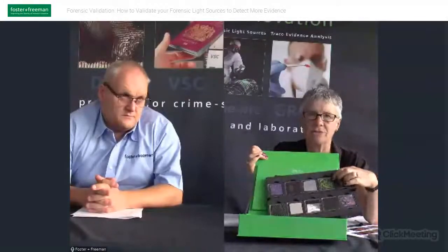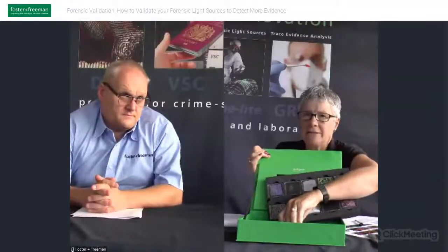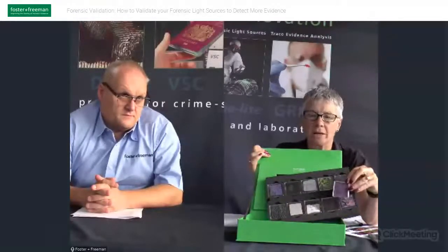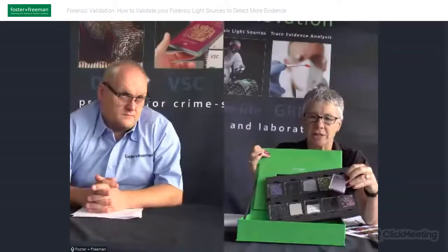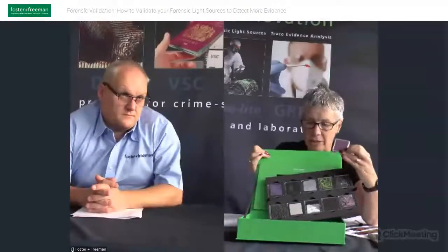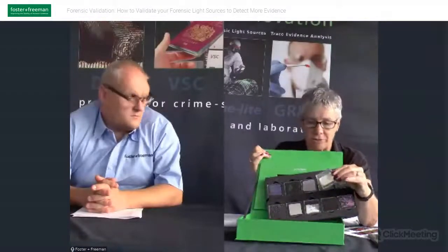So we've got a lovely fibres example, a nice fluorescent fibre. We've also got a paint sample so that you can see paint under paint using infrared. You can see through the paint almost, and this is a really lovely example. And we've got the recovered fingerprint on a brass plate, so that's a real sample.